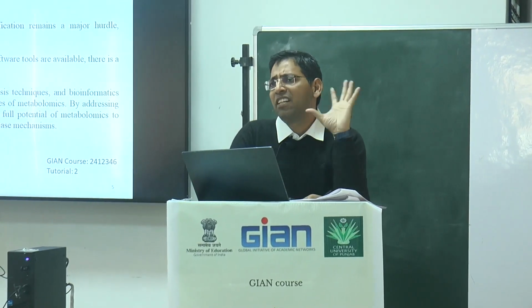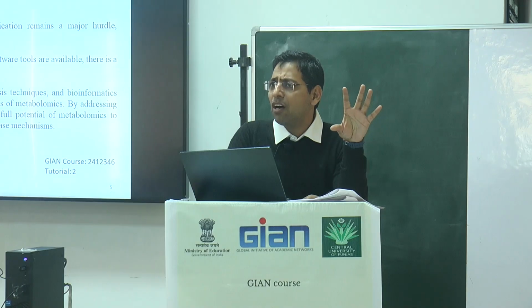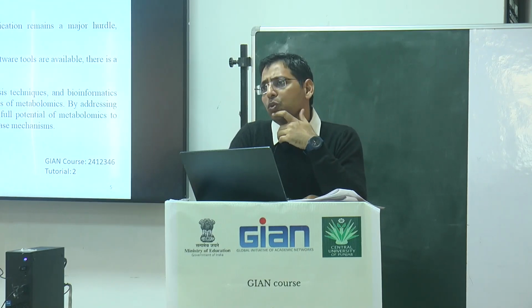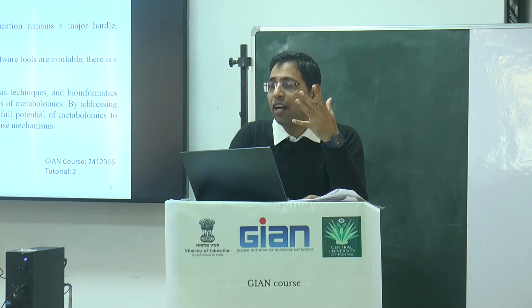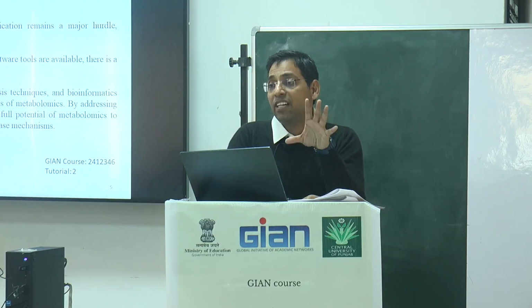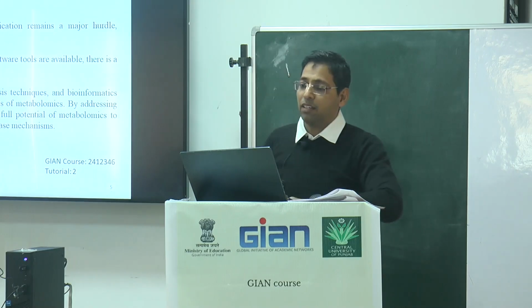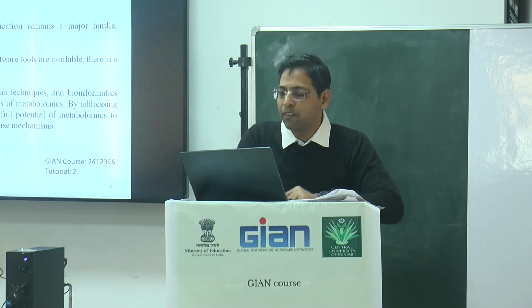The first thing is the data complexity. Data is so robust, and if you are running every day, we analyzed more than 92 LCMS spectra of 92 samples. They have the biology. It took only 6 months that we invested to analyze that data in our labs. Ritu carried out that work very fantastically, and we are going to submit that paper in metabolomics or lipidomics here.